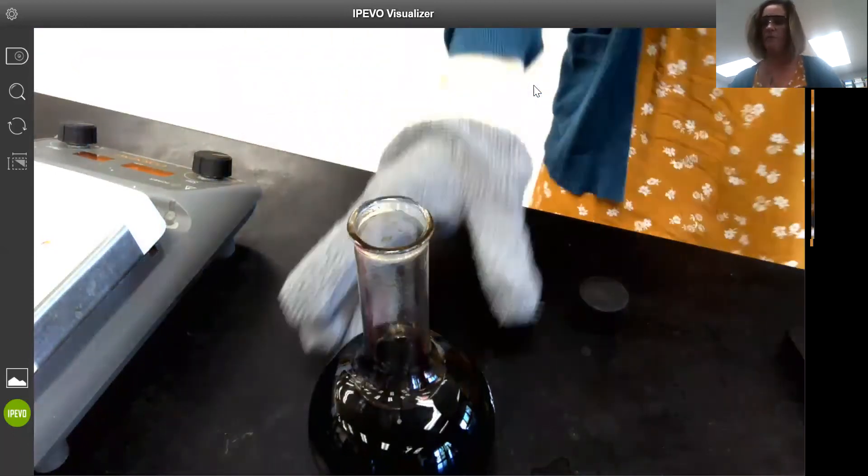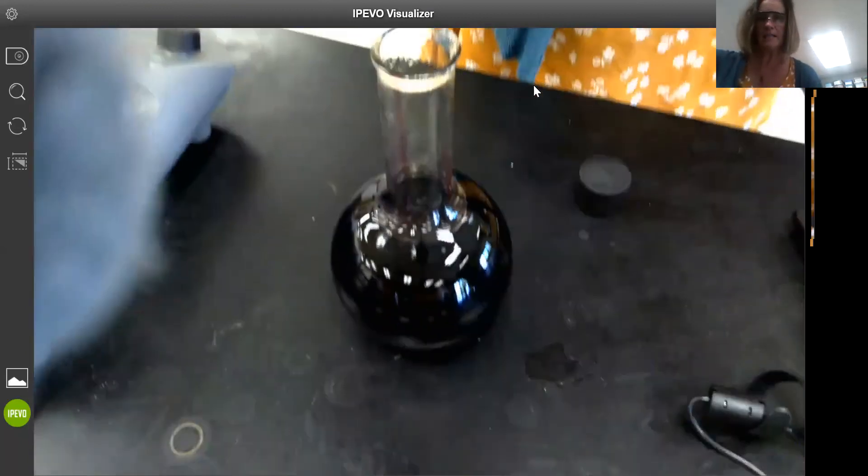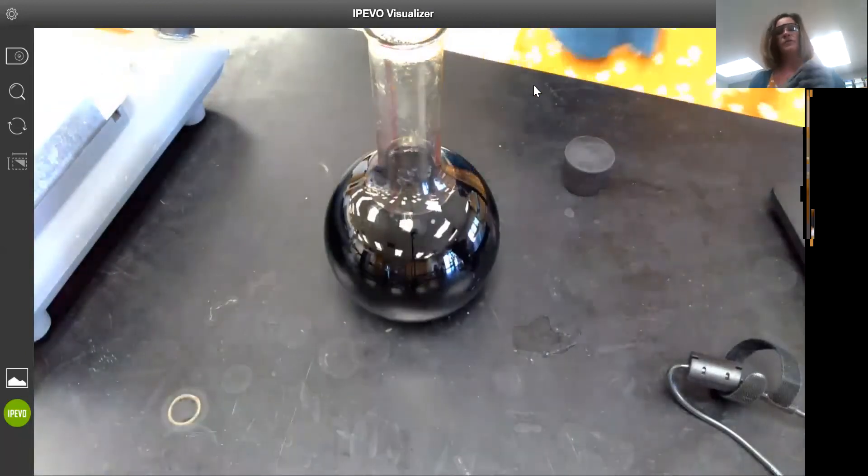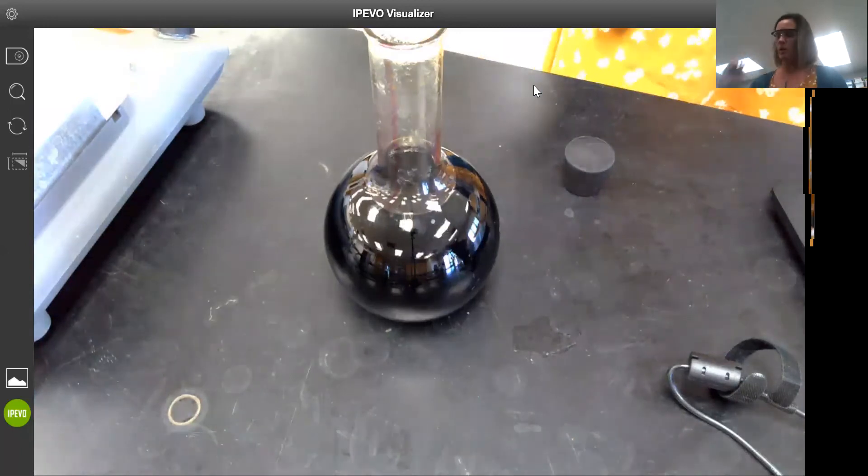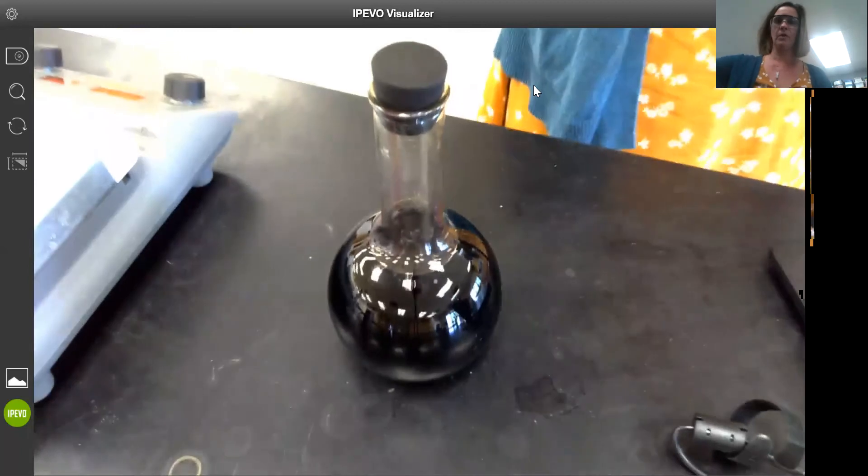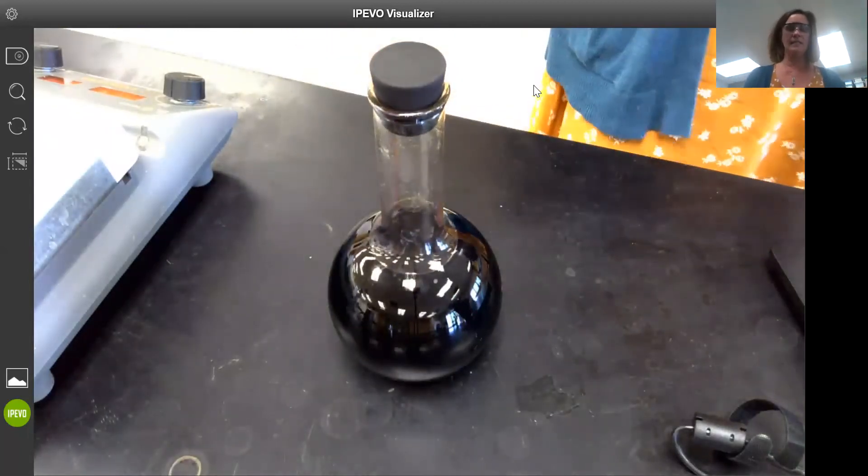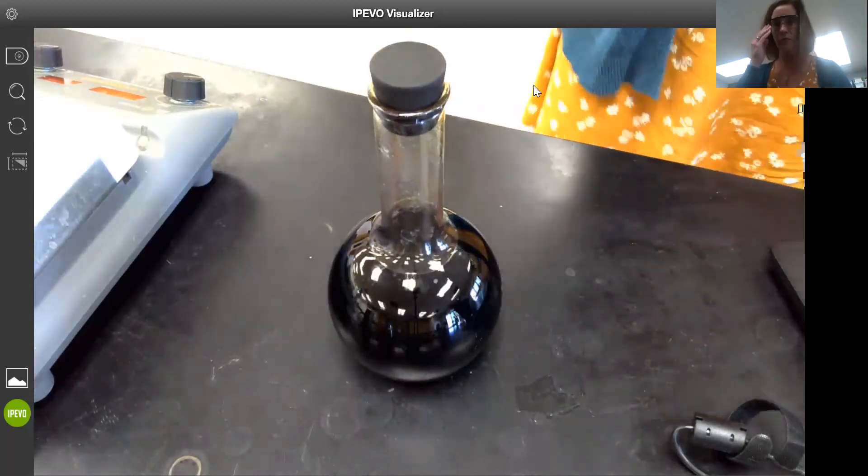Now this solution that we've made here in this step is light sensitive, and so for storage purposes we're going to put a stopper in it. Once it cools down I'll put a rubber stopper in and then I will wrap the entire flask in aluminum foil for storage.